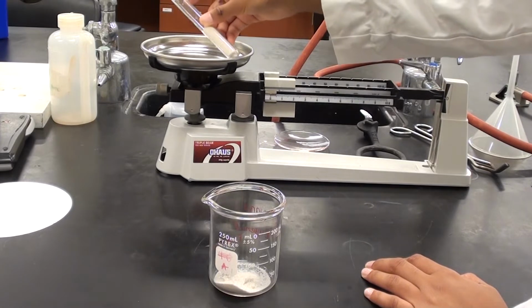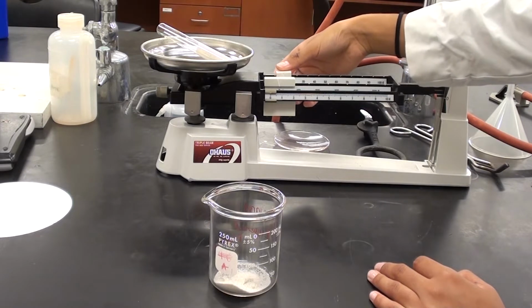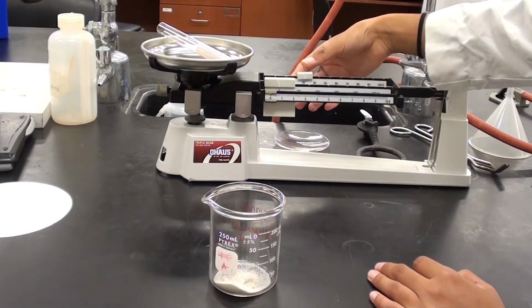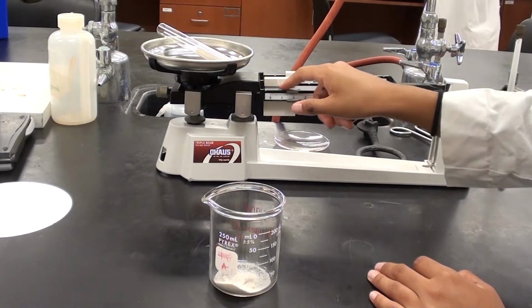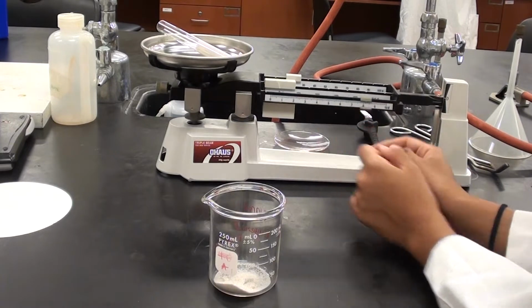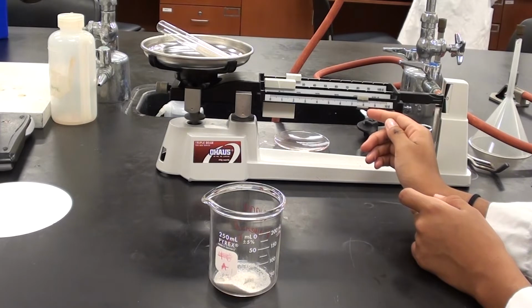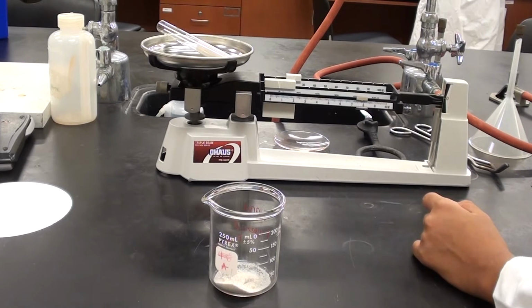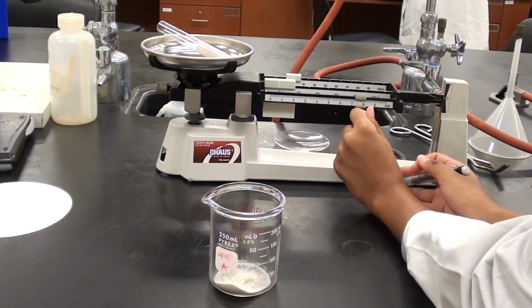And again, she's just putting it on the balance, again without the stopper, you'll notice, because we want to be consistent about this. Now again, she's putting the stuff in the notch, making sure it's in the notch. Make sure it's in the notch, Sabrine. There we go, that's good. Now it's in the 20 notch, right? Okay. And now she's reweighing it. The difference between what she did first and what she's got now will be the amount of sand that's in this beaker right here. So she's going ahead and weighing that. Again, she'll weigh that to 2 decimal places.